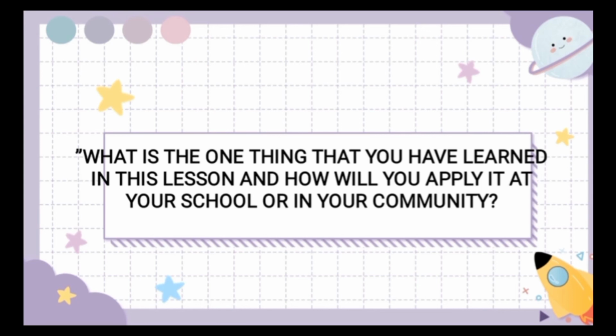What is one thing that you have learned in this lesson and how will you apply it at your school or in your community? I hope you have learned the different parts and functions of the microscope, class. Microscope is very useful, especially to you as students, to all of us, because it is used in studying microorganisms, cells, molecules, structures, and is also a very important tool used to examine tissue samples.